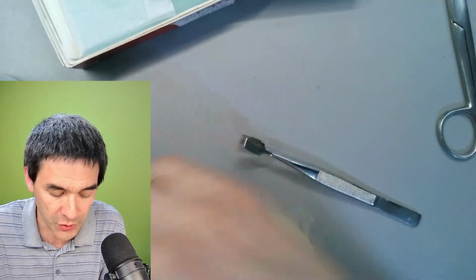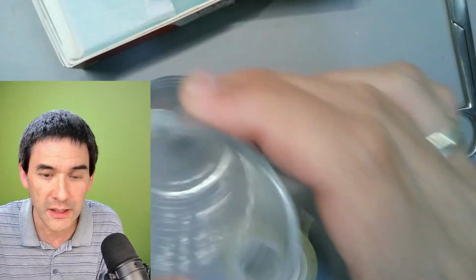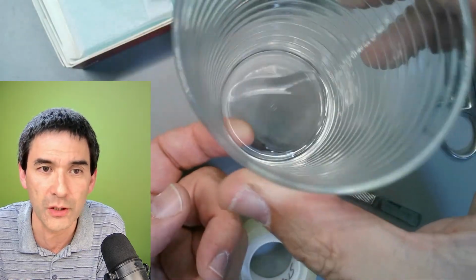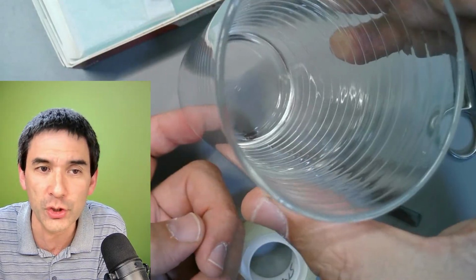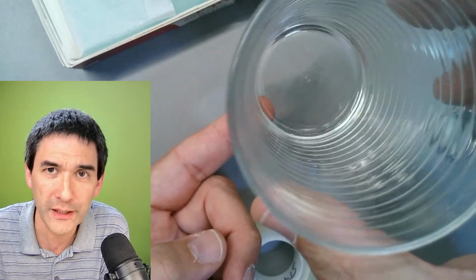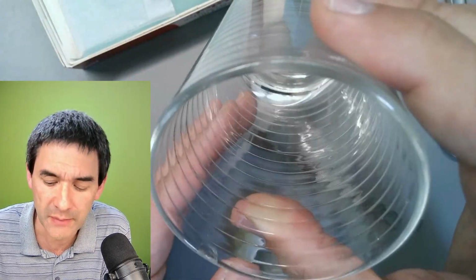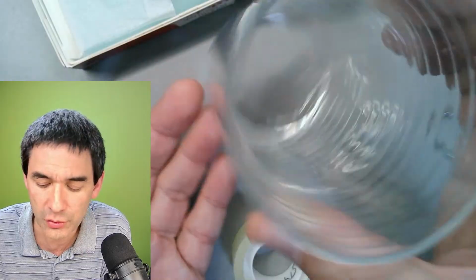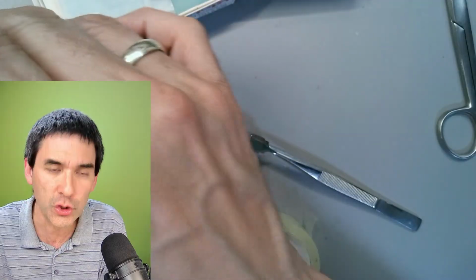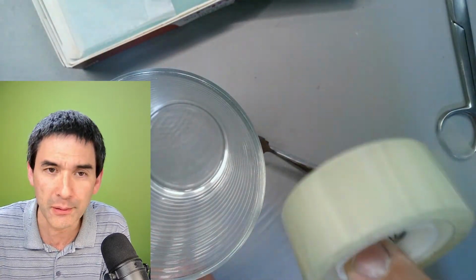You need, of course, microscope slides. Okay, and here, this is regular. You don't see it because it's just a couple of drops. This is just regular vegetable oil. Don't use immersion oil for that, because immersion oil does contain, I think, some substances that might not like. But this is just regular vegetable oil, and it works. And we're gonna use this vegetable oil to get the face mite off the tape again.